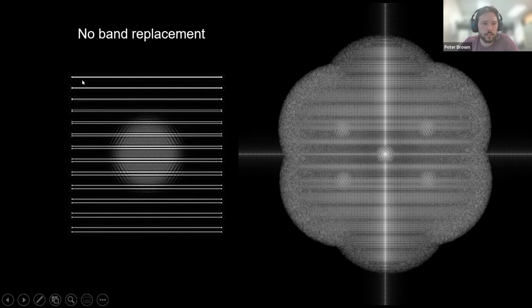So here we've simulated a pattern that consists of a pair of line pairs that are progressively further spaced apart, and a few microns above it, a fluorescent disk. If we naively apply our SIM reconstruction algorithm, you can see we do a decent job of reconstructing the line patterns, but we're corrupted by this out of focus light that exhibits various ringing artifacts and also sort of hammer stroke artifacts. And if we look at the Fourier transform of this image, we can easily see the regions where this disk is creating artifacts.